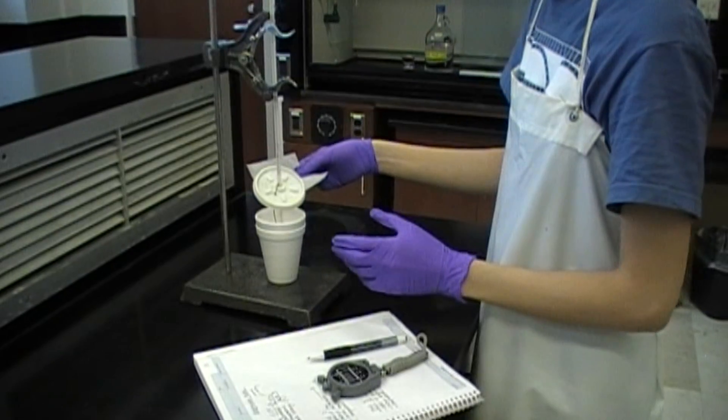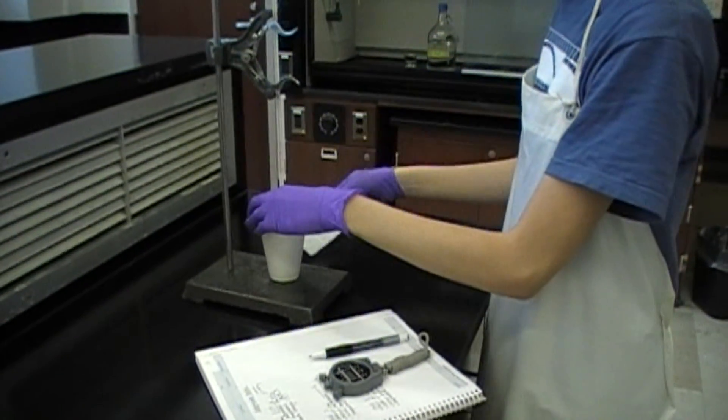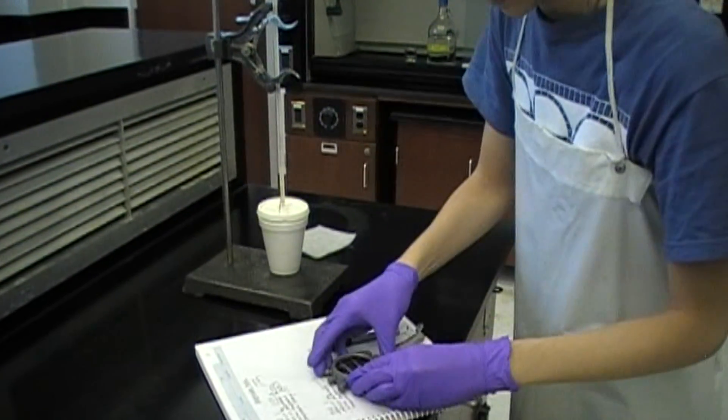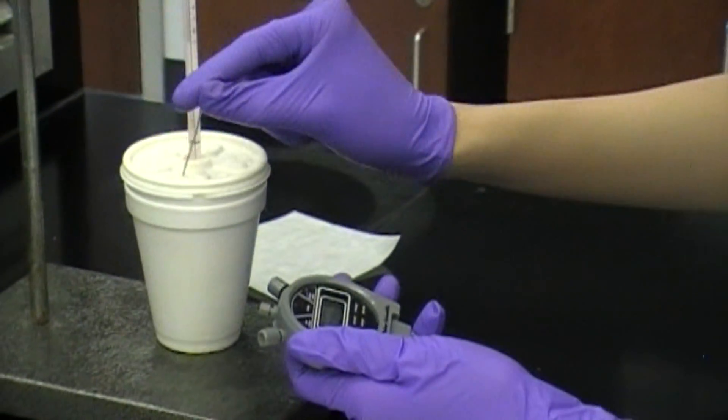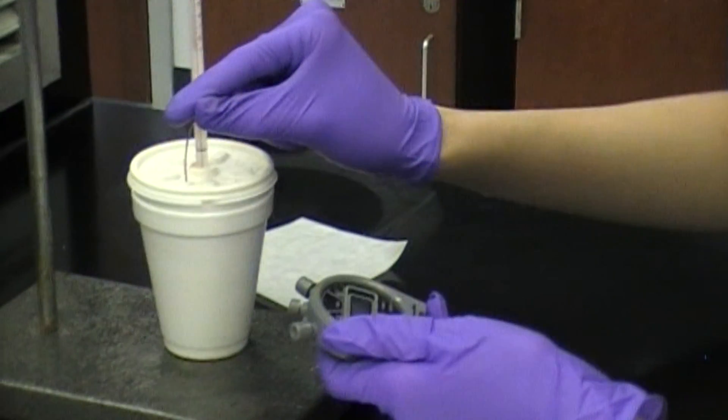Now we get to the exciting part. Add the magnesium turnings to your calorimeter, and immediately close the lid. Start the timer immediately, and also begin stirring your solution.